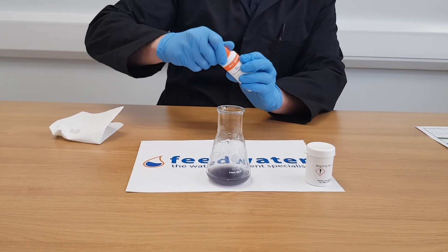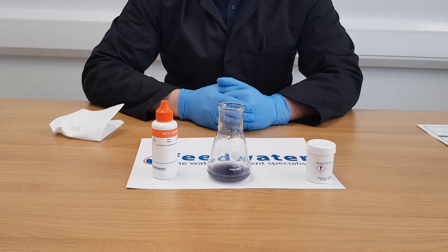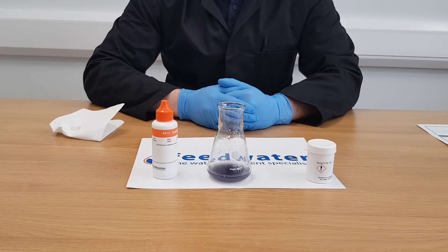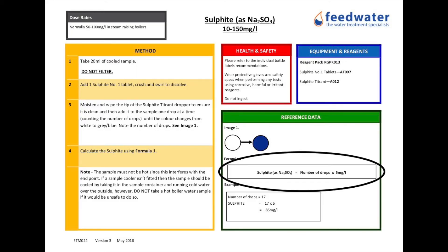Using the formula found in the method, calculate the sulfite concentration. Each drop represents 5 mg per litre of sulfite in the 20 ml sample. So, for example, if the test took 17 drops, then you would multiply 17 by 5, which gives you a sulfite reserve of 85 mg per litre.